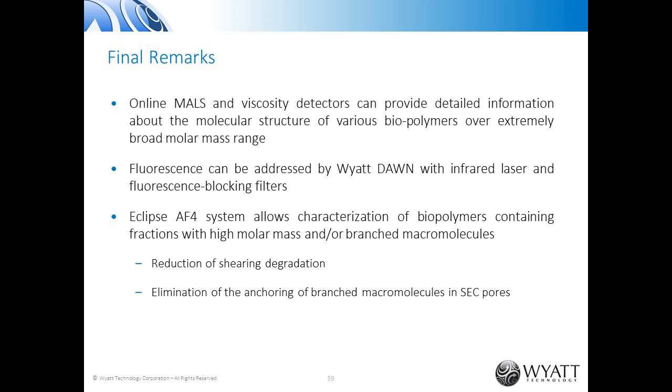Concerning depolymerization, you probably don't need the information that rapidly, but again, it would be SEC-MALS. Probably you don't need APC and micro detectors, so you can use regular SEC columns and a regular line of detectors. So the mass detector would be the most important. And if you also want to follow the branching development, then of course a viscometer would also be recommended.